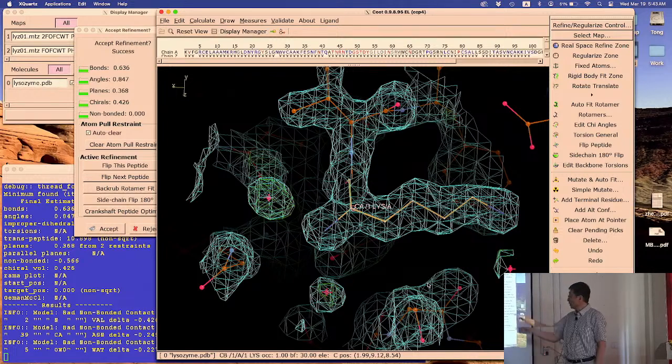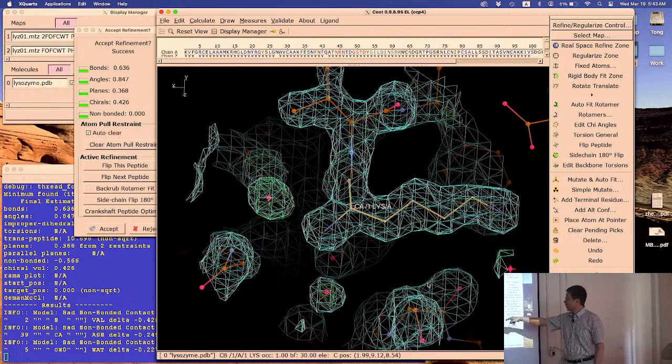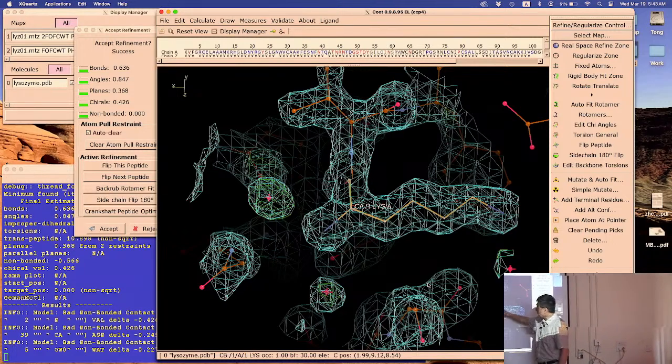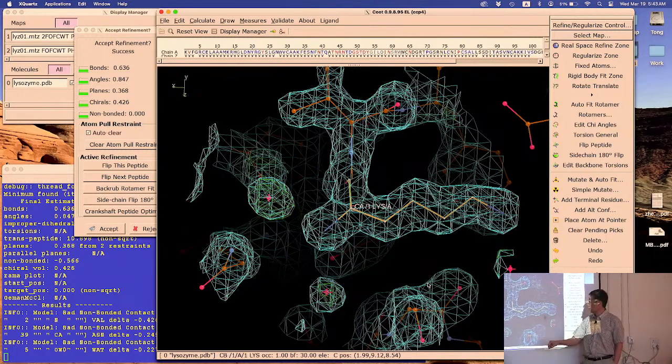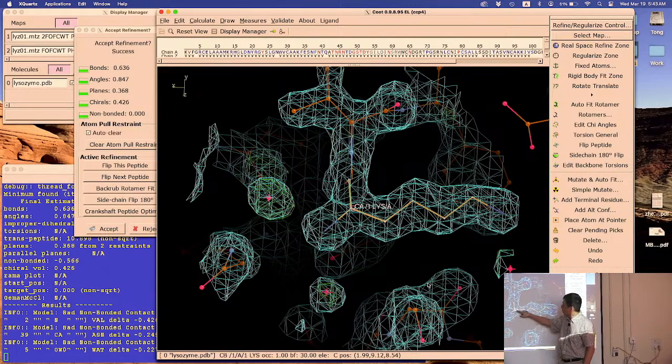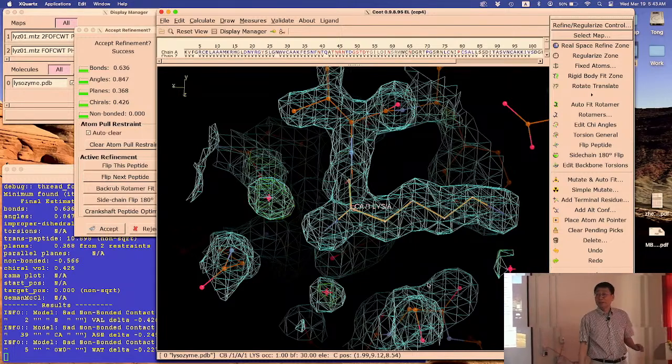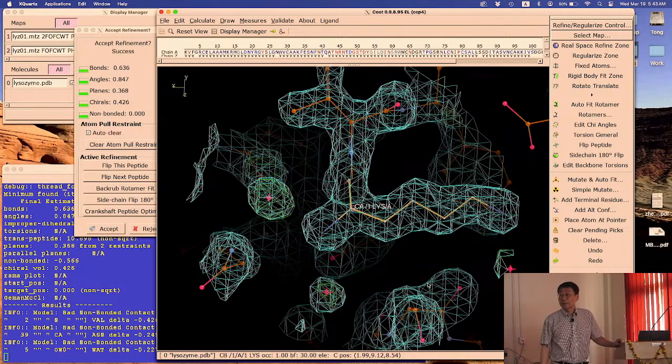Yes. Something like this? You can see the electron density map is zigzagging, and the chain is zigzagging too. So it's a very good fit. The amide nitrogen is in this big bulk density, and the amide bond to the next residue is there. Got it?